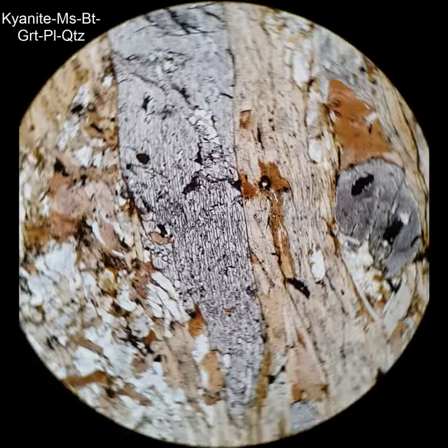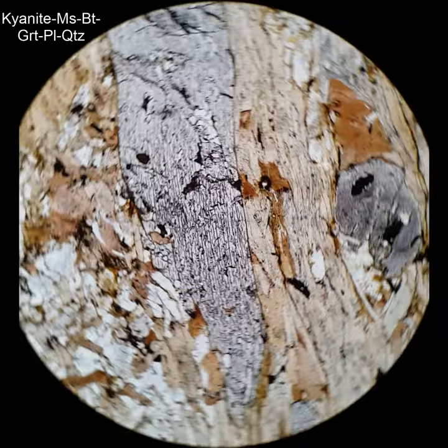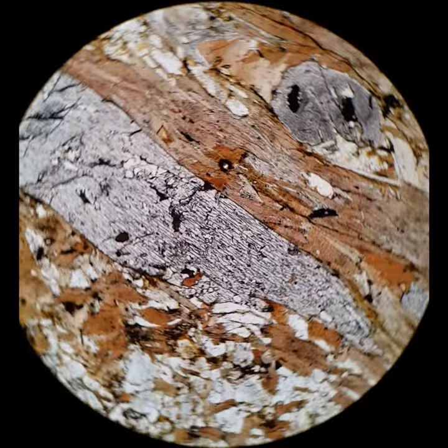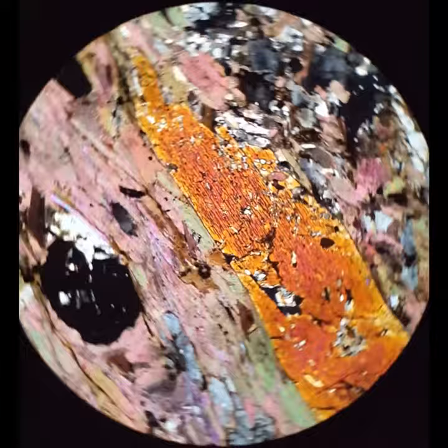This is what kyanite looks like when it's deformed. Again, you can see the cleavages running along the elongation of the crystal. When I cross the polars, you're going to see that the whole crystal doesn't go extinct all at once. It has this kind of sweeping or undulatory extinction. That's because the crystal is bent, so parts of it go extinct at a slightly different angle than other parts.